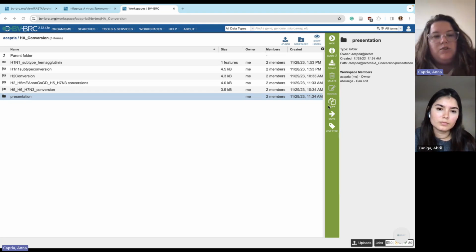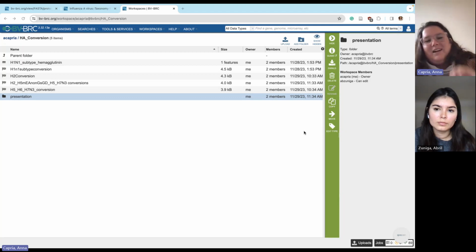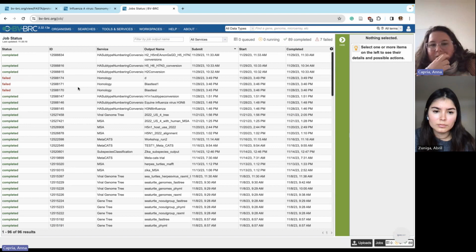You have to share the larger unit of the workspace. There's nothing to say that a workspace can't just have one file in it, but if you're ever like, she said I could share and I can't figure out how to do it, just make sure that you're actually sharing a workspace. So I probably just talked about that long enough for our job to run.